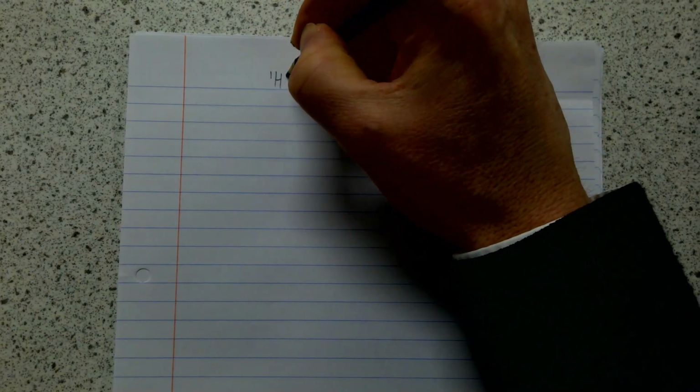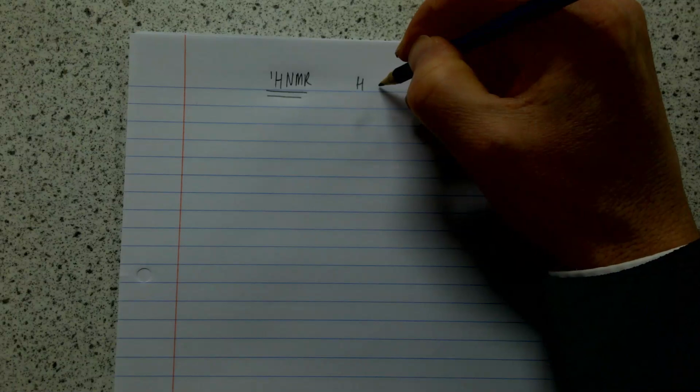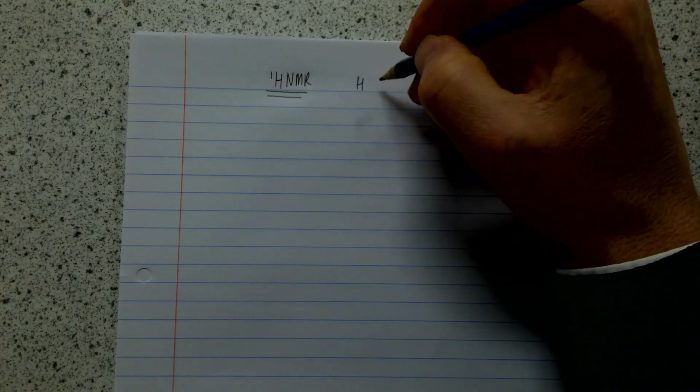Alright, so we're going to do a sort of revision summary, but for the first time for some of you, on proton NMR. NMR stands for nuclear magnetic resonance. Okay, so this is a tool to identify hydrogen types or hydrogen environments in a molecule.